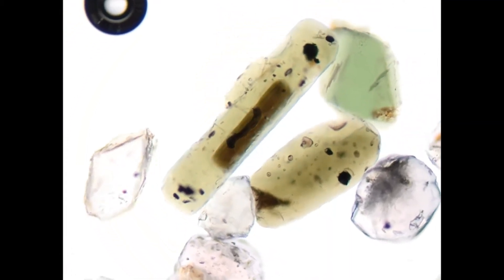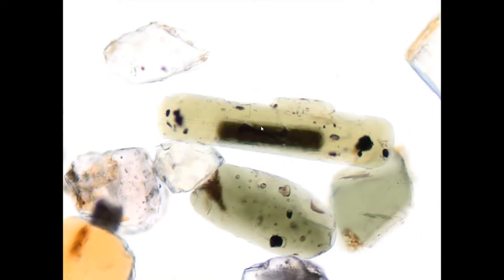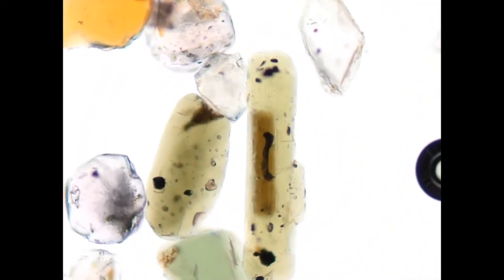If we turn the table, we see a weak pleochroism from lighter yellowish green to richer green colors.